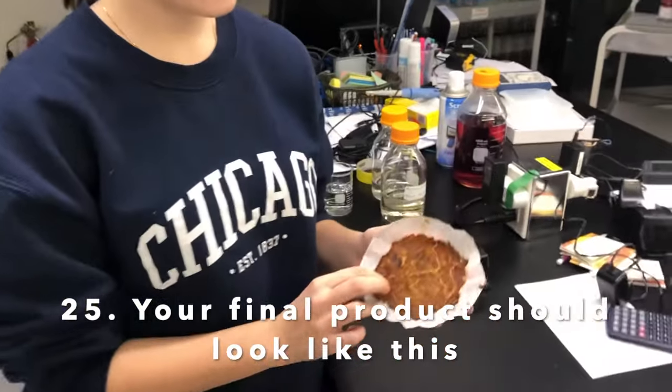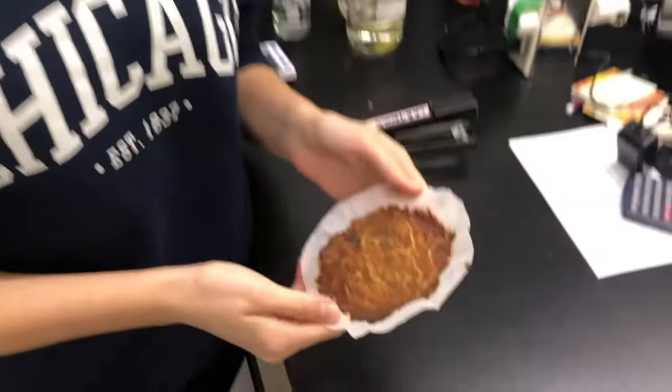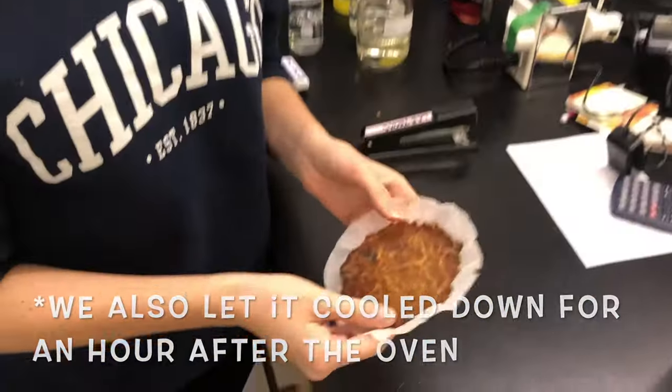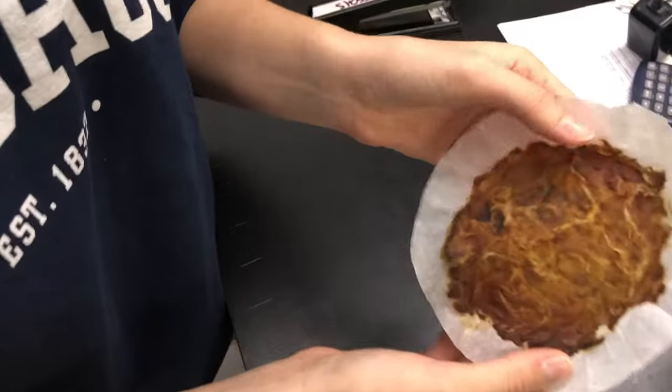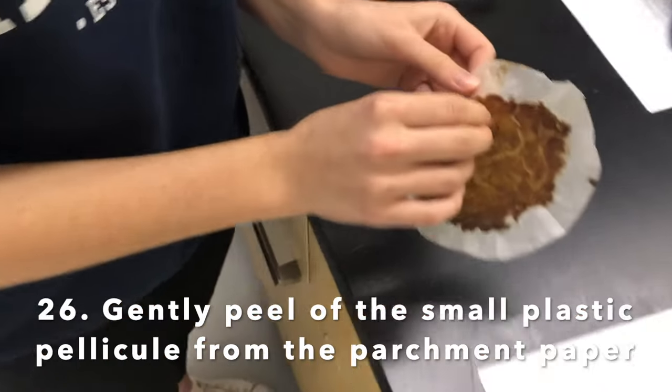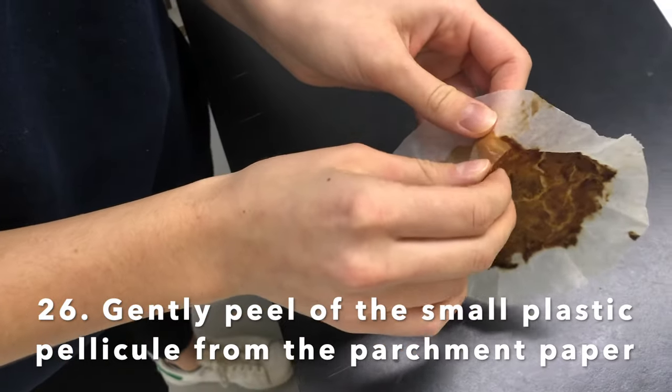This is our bioplastic after being in the oven for at least an hour at 130 degrees Celsius. We also let it cool down for at least an hour. This is the final product, and now Emily is going to peel off the small plastic film.